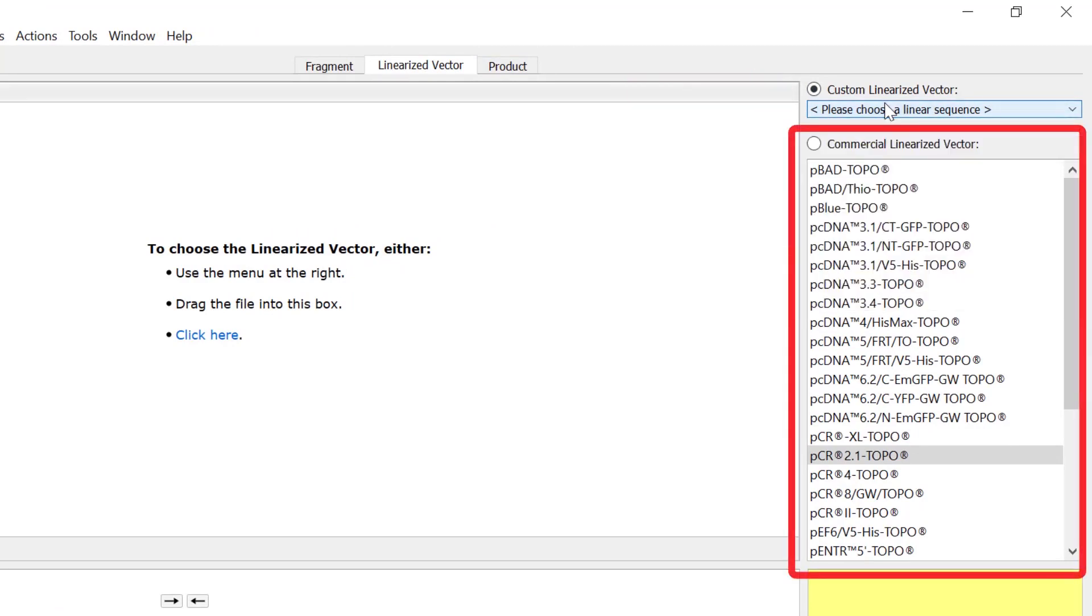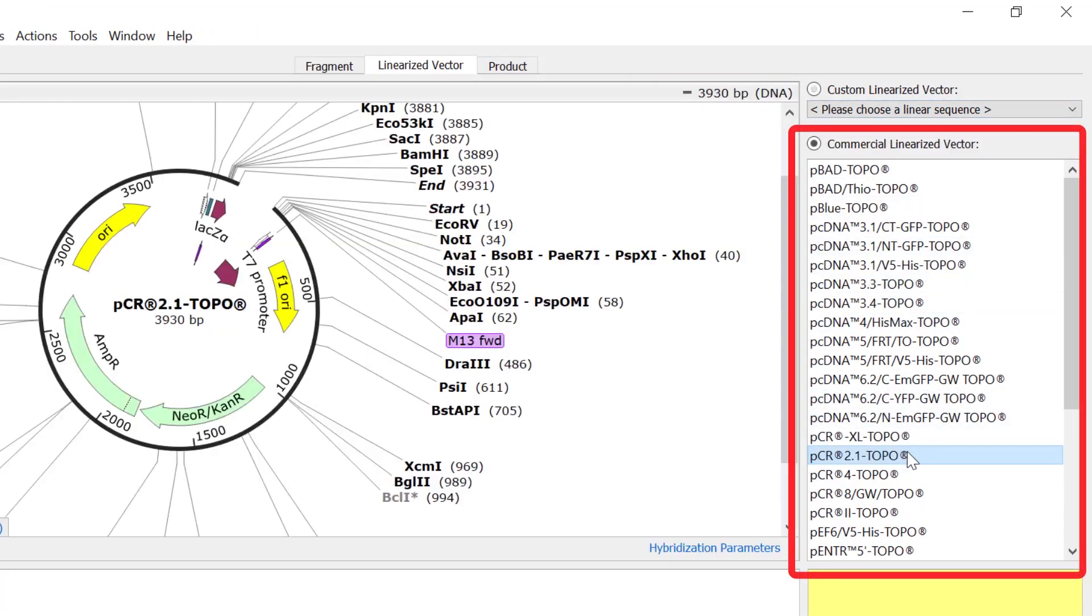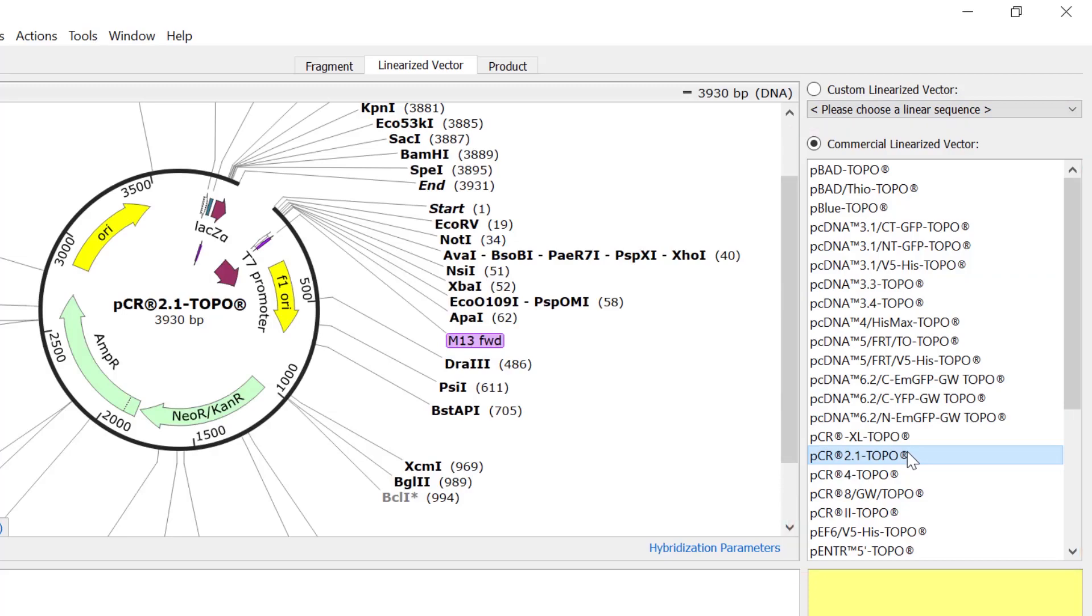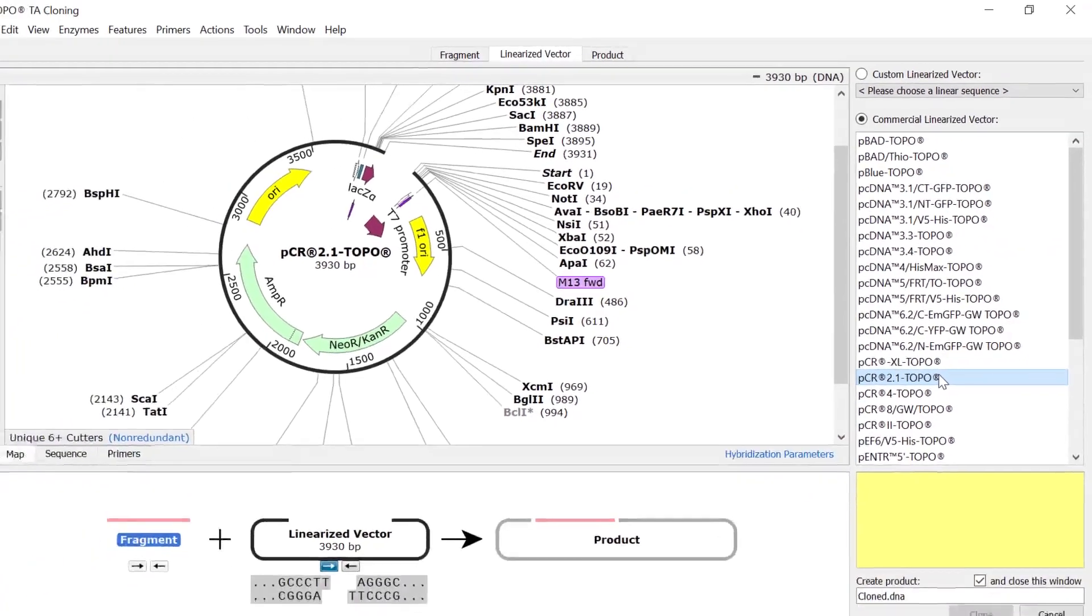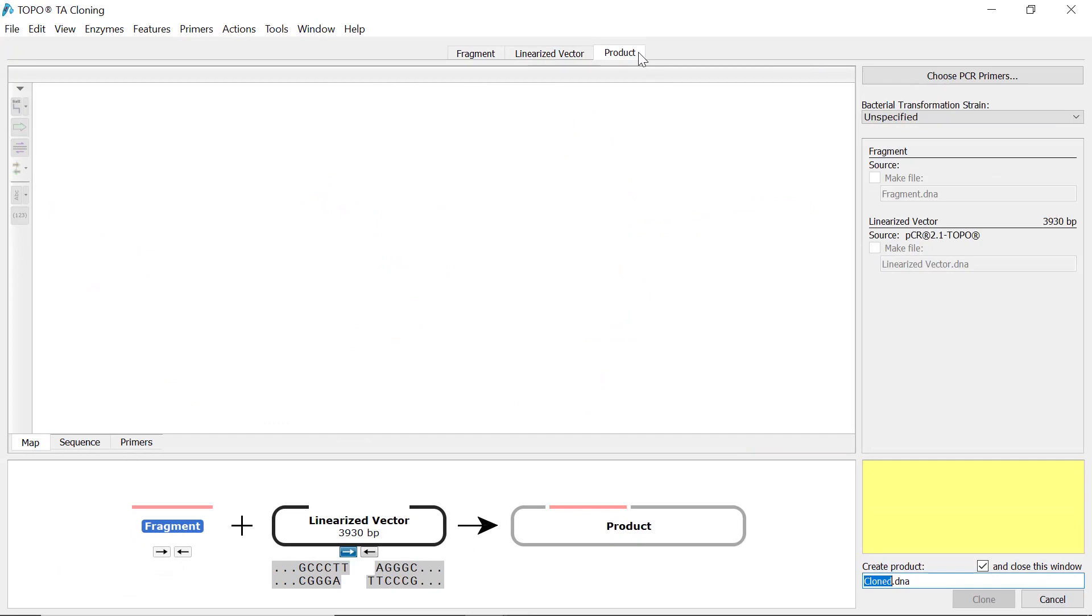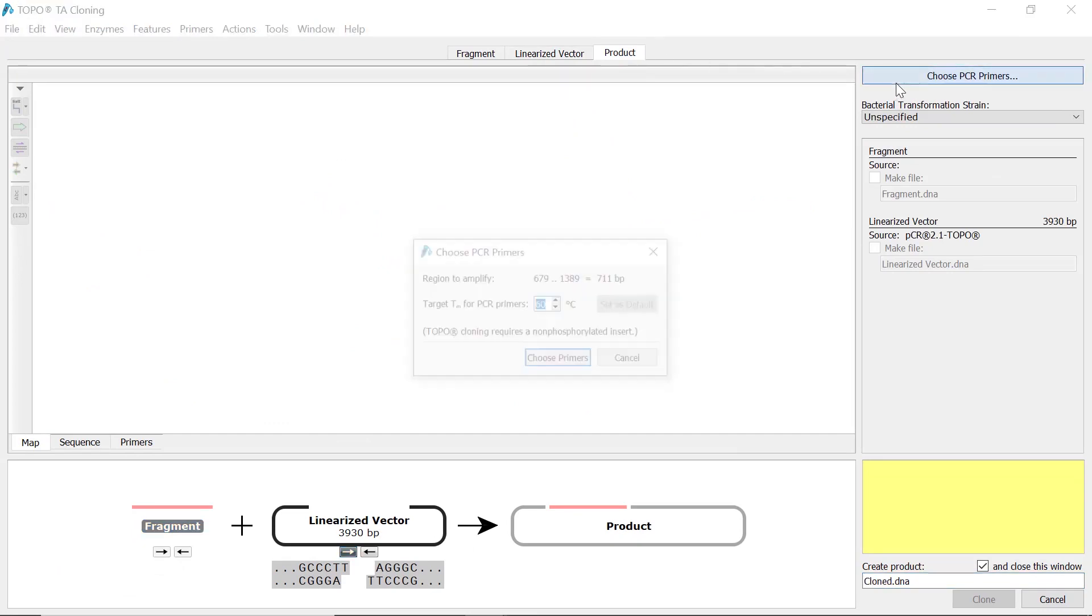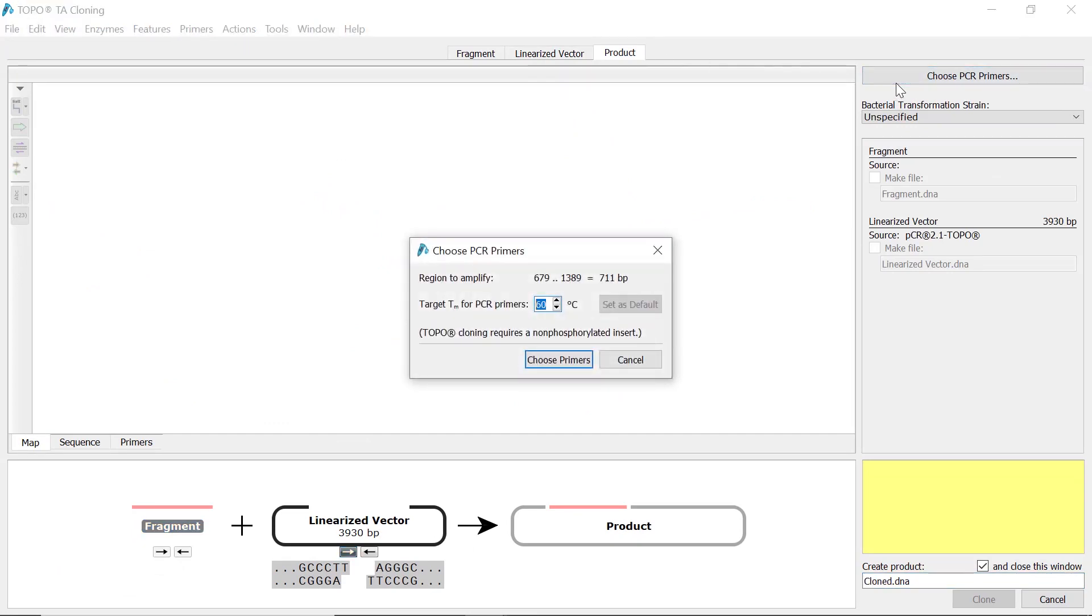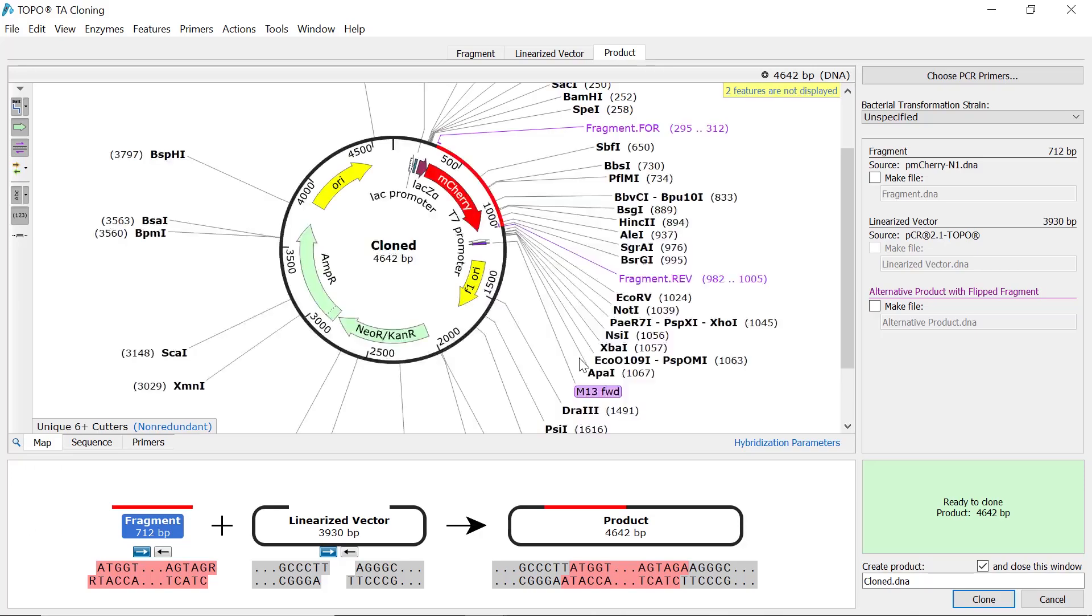The final step is designing primers. Switch to the product tab and select choose PCR primers. In the new window, adjust the desired target melting temperature for the PCR primers, and once happy with these settings, click choose primers.